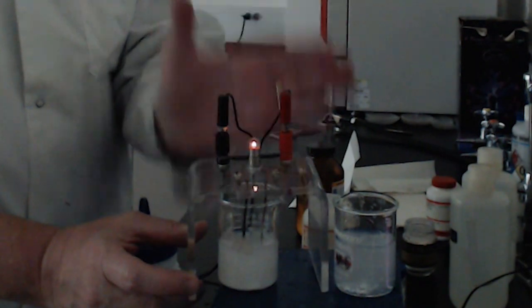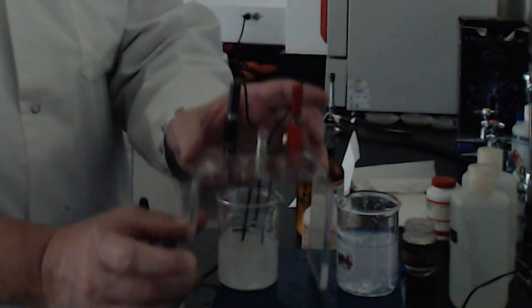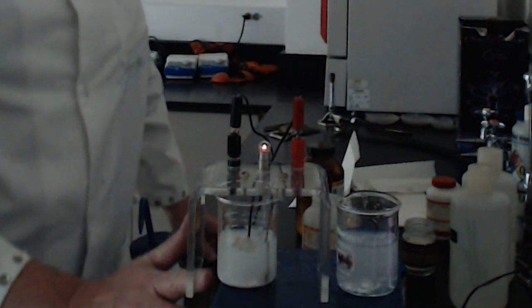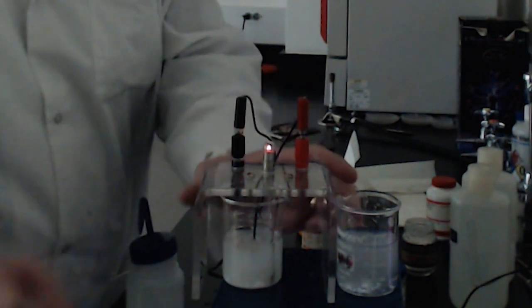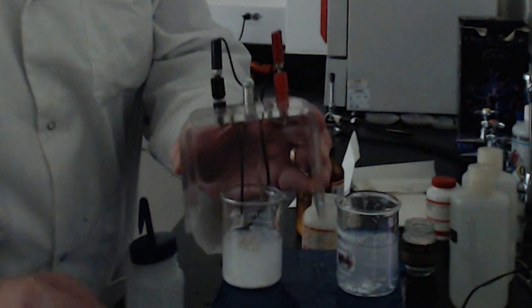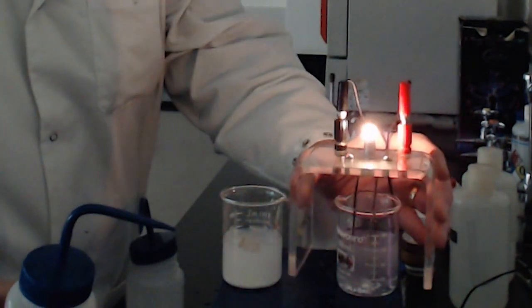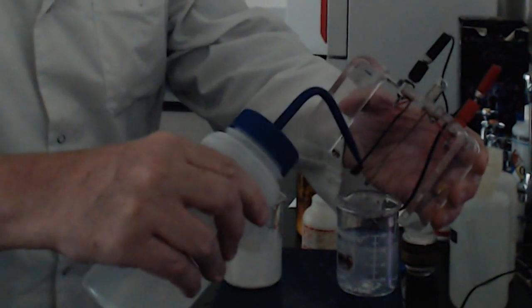Calcium sulfate, can we even see the glow? Oh yeah. Calcium sulfate is actually classified by some chemists as a moderate electrolyte. Well, that's not allowed in our class. So we're going to classify calcium sulfate as a weak electrolyte because it does not glow the same as a strong electrolyte like the magnesium sulfate did.